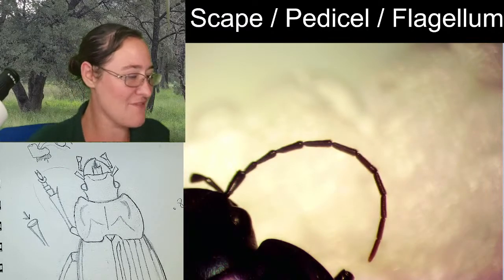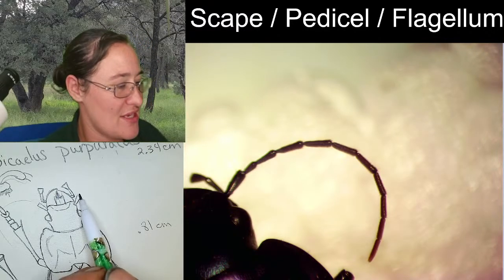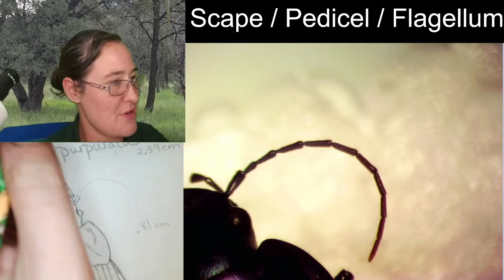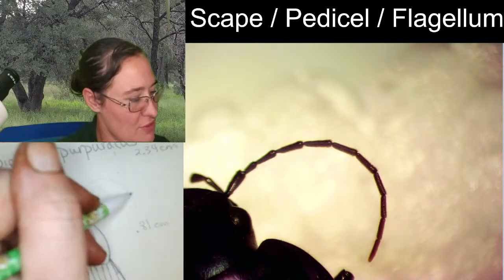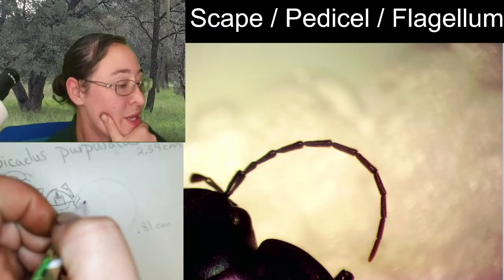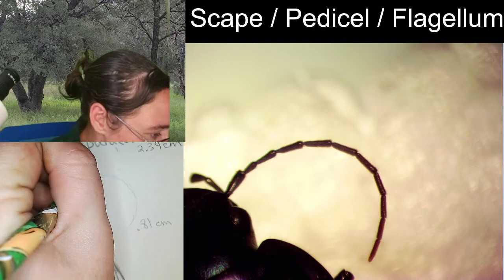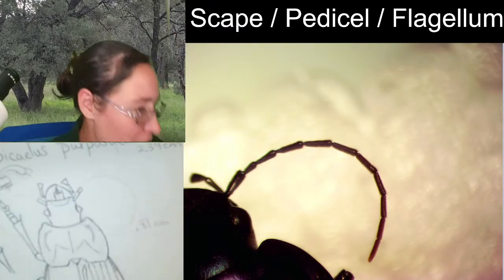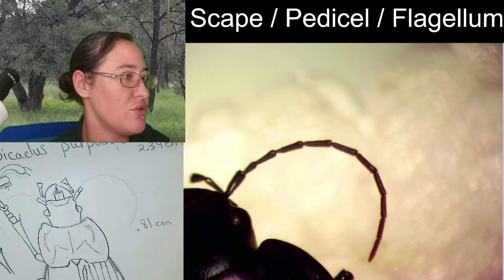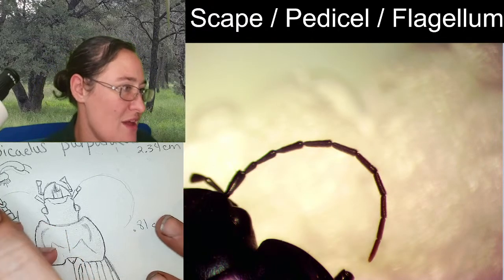We already have the scape connected to our head. I'm just going to take this antenna and wrap it around back. When it wraps back around, it comes about halfway down the pronotum, so that's what I'm aiming for. We've got that segment that's the scape. We have a shorter segment that is the pedicel, and then there are 1, 2, 3, 4, 5, 6, 7, 8, 9 segments of the flagellum.